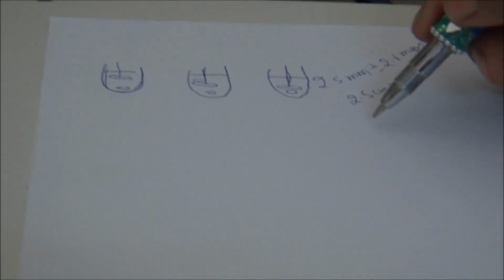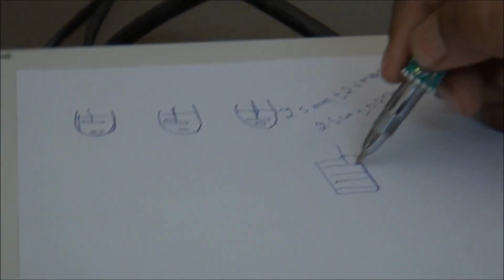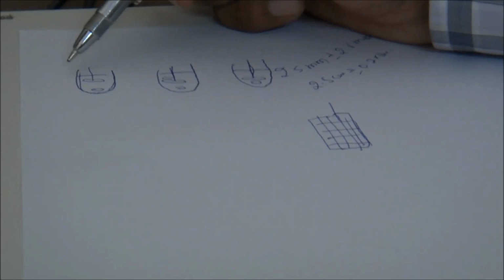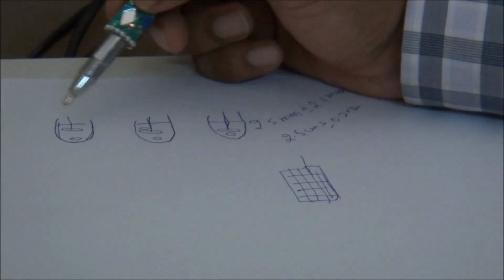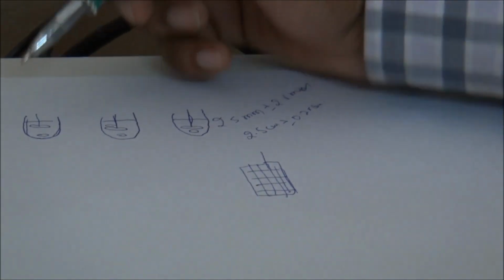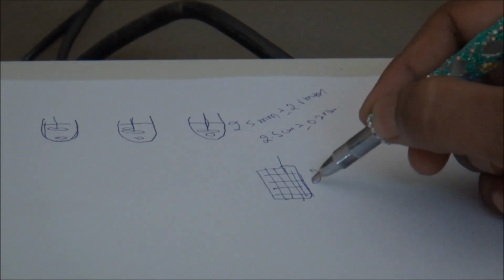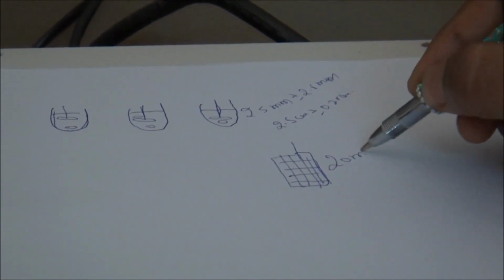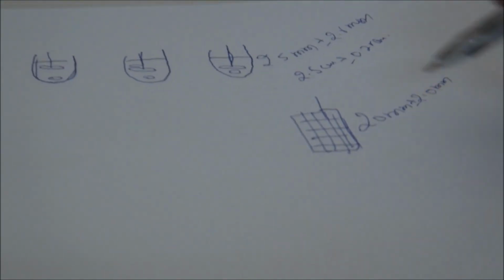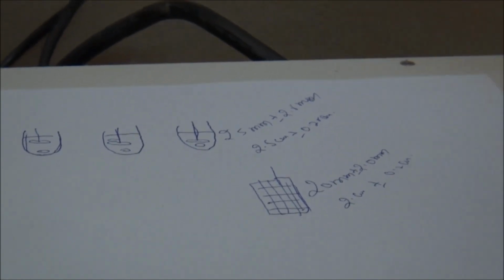If you are using a basket apparatus, obviously, as you can see, the basket does not have any type of paddling or impeller system. It cannot cause much turbulence. So to get the required turbulence as that of a paddle, we are going to come a little closer to the tablet. So we are going to reduce the depth here, and it is going to be 20 mm plus or minus 2.0 mm, or 2 centimeters plus or minus 0.2 centimeters.